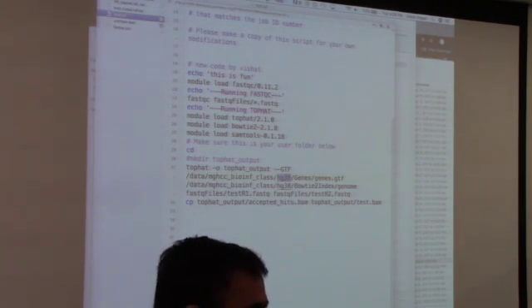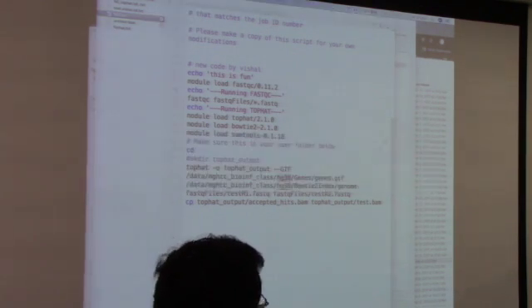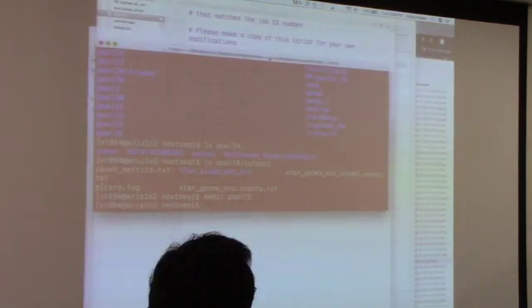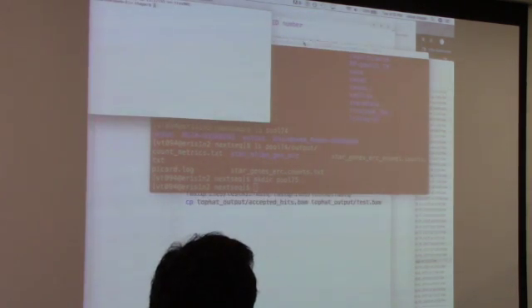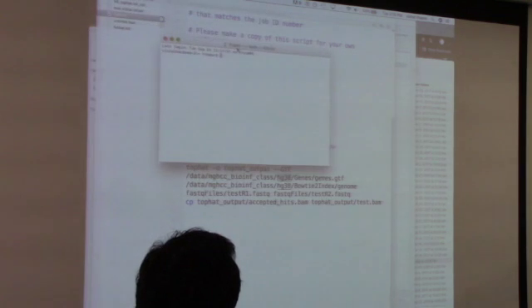Okay? Okay. So give me a second. Let me do that. And I'm going to show you how you do that so that in case in future you want to. This red thing looks good when we're doing this. Let's do it basic. There you go.